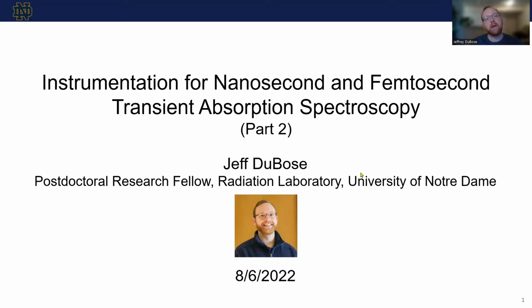And today we'll be talking about the instrumentation for both nanosecond and femtosecond transient absorption spectroscopy. So this is part two of basically a two-part video series. In the first part, we talk a lot more about the principles of transient absorption spectroscopy, a lot of the basics, you know, how to look at spectra and kinetics, literature examples.